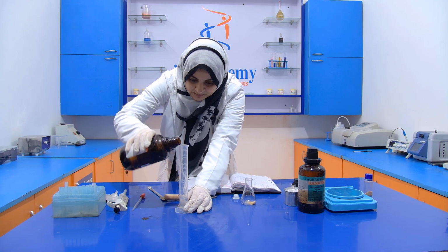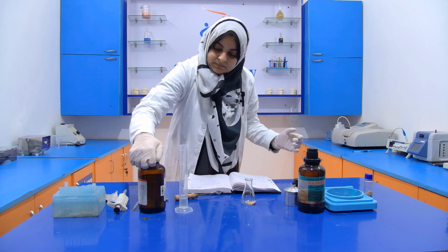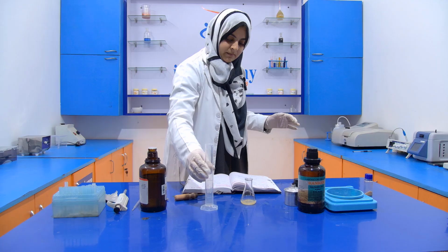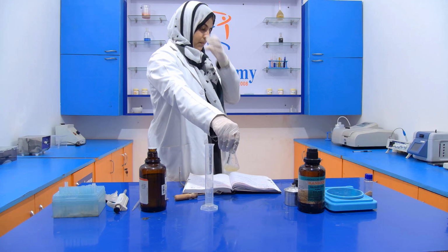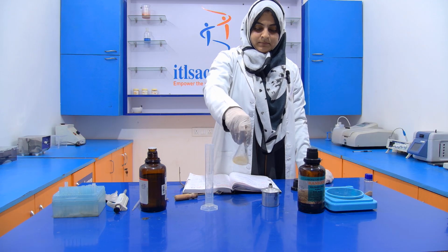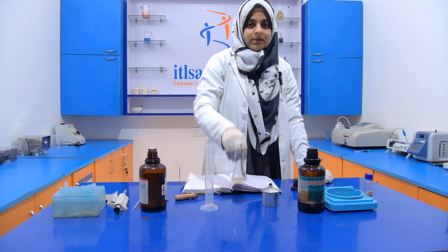Now we measure this acetic anhydride with the help of the measuring cylinder. Now this is your 10 ml. Now add this 10 ml into the solution. Now mix it properly. Now you have to heat it gently and then you have to cool it. So we will see that after cooling it.